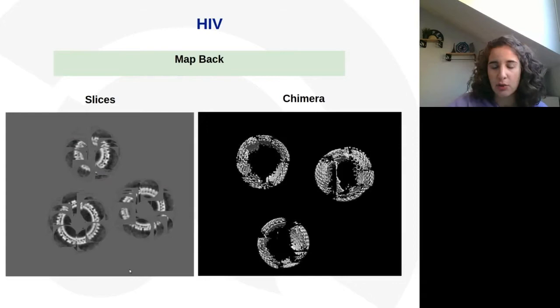So we want to remove them because we can see by eye that they are not in correct orientations. This also can be very useful to think about the biological sense of our sample. Maybe not in this case because we already know that the proteins are from the capsid of the virus, so it makes sense that they are arranging the capsid of the virus.